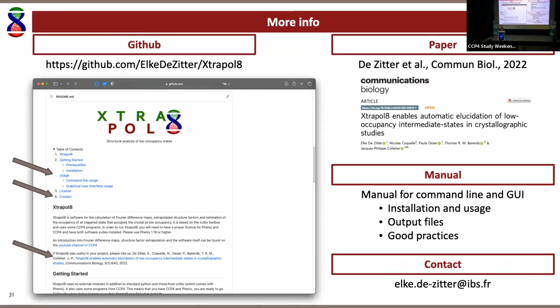Thank you, Ivo from Southampton. I would like to ask you, what's your favorite Bayesian weighting scheme? How, as a user, should I decide which scheme to use? And another question, I'm sorry, maybe it's not a nice question: how do I avoid false positive results, because sometimes maybe using this I can introduce some model bias in my results, so then I will just see what I want to see.